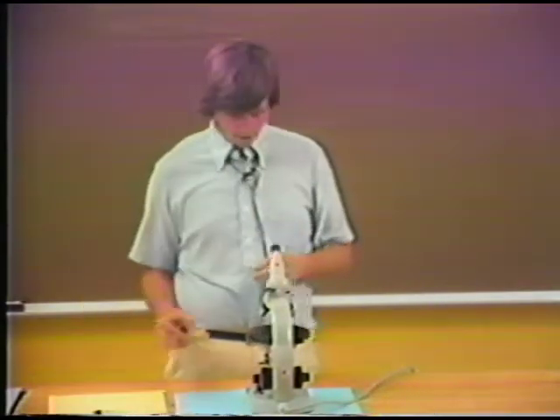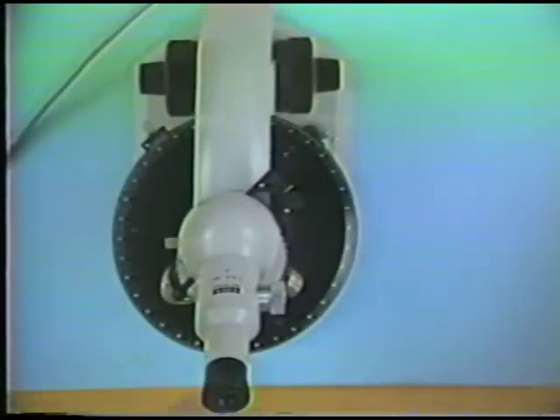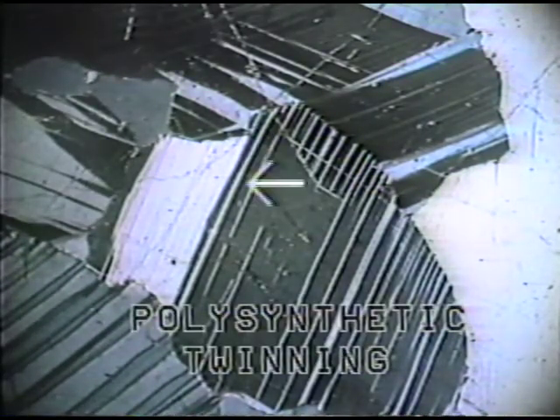To demonstrate this, I have a thin section of an anorthosite. An anorthosite is a rock, of course, made up virtually entirely of plagioclase. And we're looking now at the plagioclase in cross-polarized light. As I rotate the stage, you can see, and I'll point out for you specifically, the polysynthetic twinning, which is so characteristic of plagioclase. It's this style of twinning, sometimes called albite twinning, which helps us identify plagioclase.